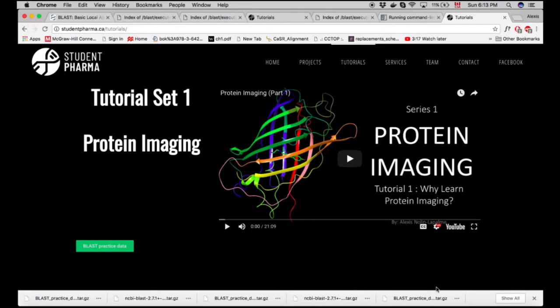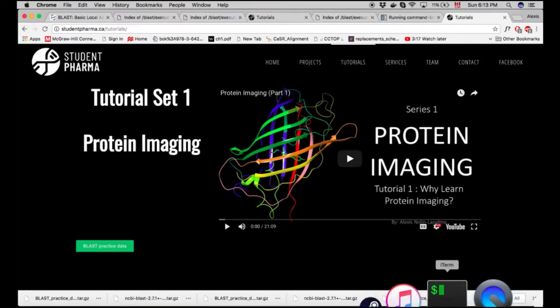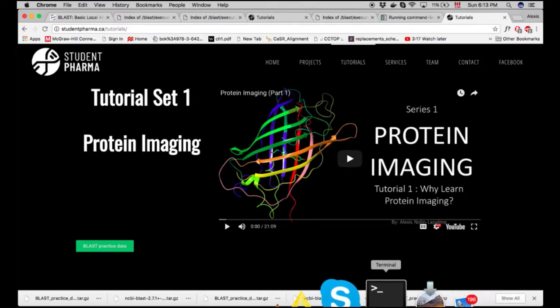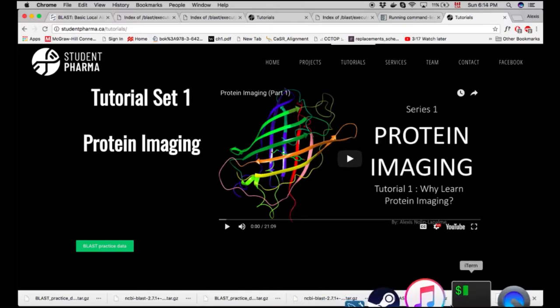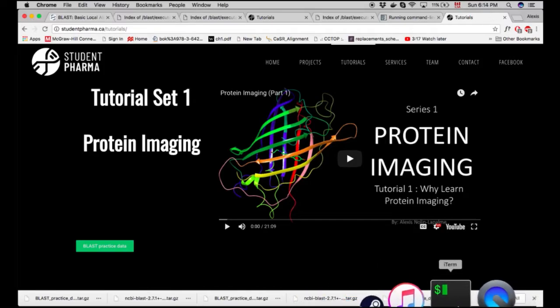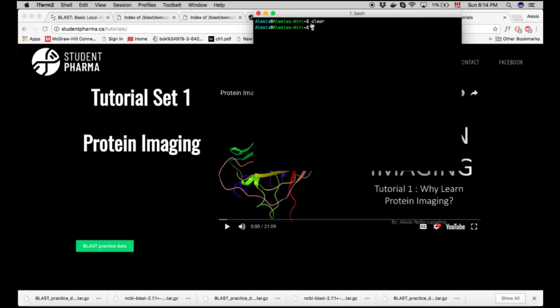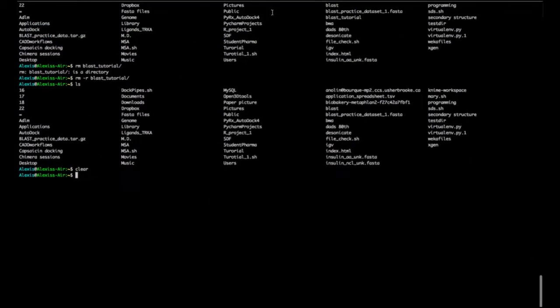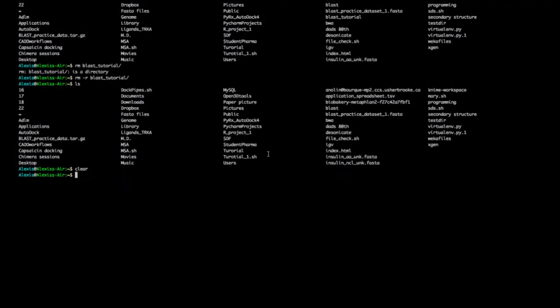Now simply hop on to your favorite terminal. I use iTerm personally, as it's a little bit clearer than the stock terminal. Now that everything's been downloaded, I'm just going to clear the screen.